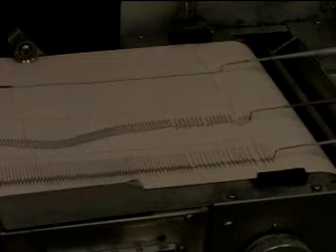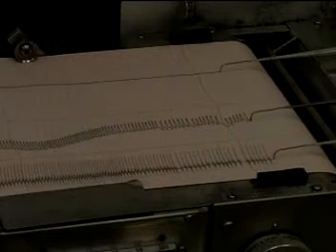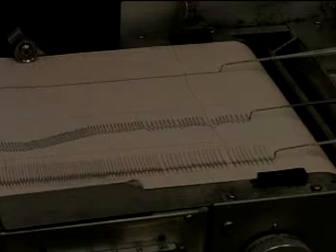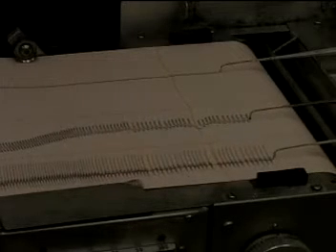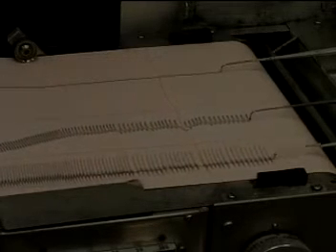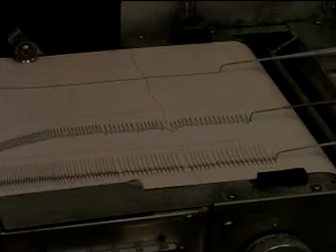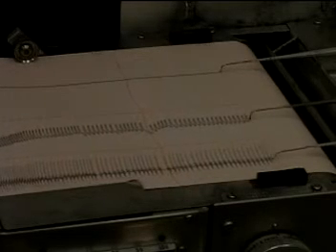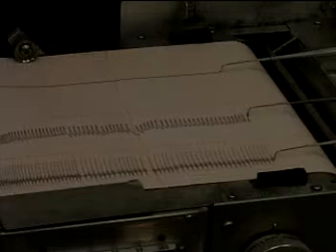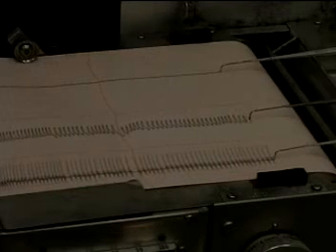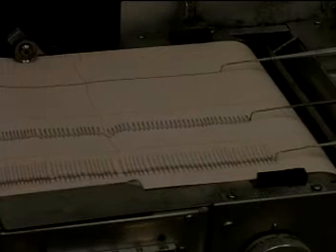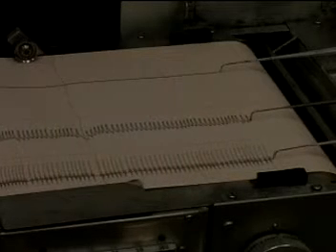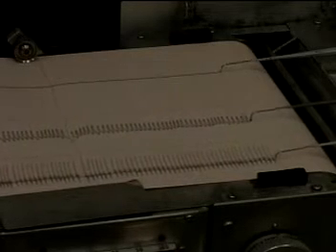You may also notice we're getting some EKG abnormalities here. This dog, because it's a pound dog source, may have heart worms and that sensitizes the heart tissue to some of the different drugs and makes it a little more erratic. You can see that the response to the acetylcholine was fairly short lived, it probably was on the order of 10 to 20 seconds at most and we are pretty much back to normal at this point.